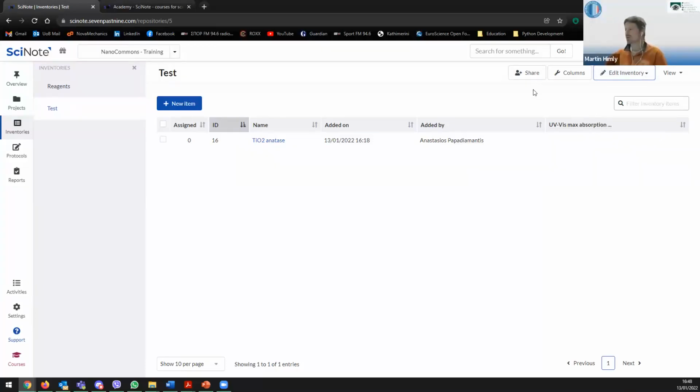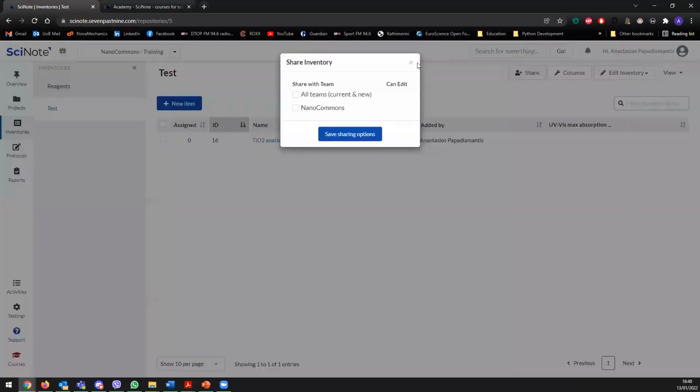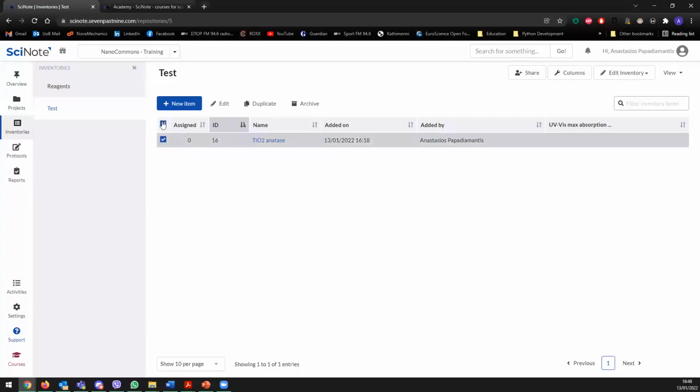Registration is free of charge for how long? Yeah, this is a service we offer for free. There are limitations, as this is a free service and I don't want to make a commercial service out of it.